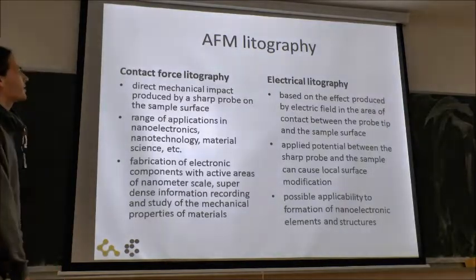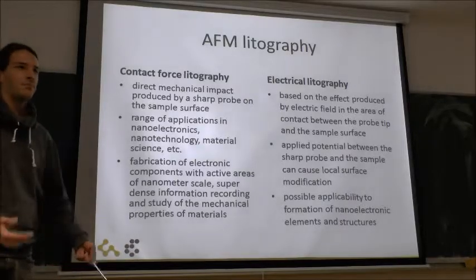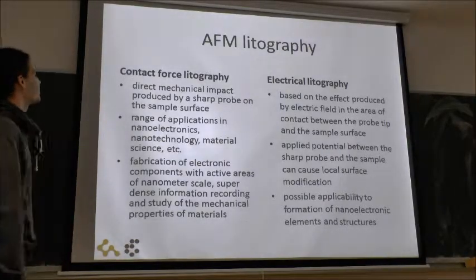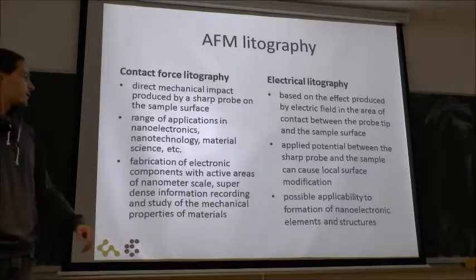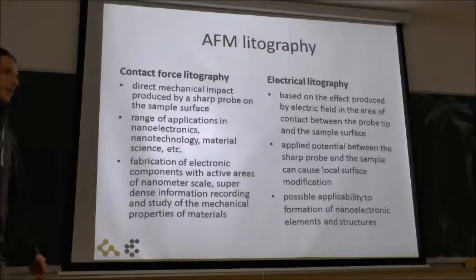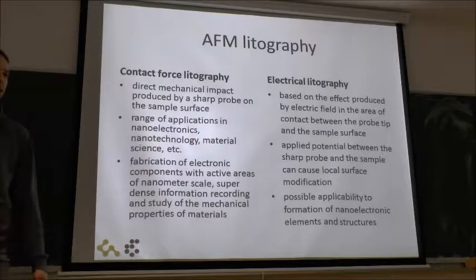What else can we do is AFM lithography. These things are maybe not so important, so I will just briefly tell that we have contact force lithography, where with the probe we are scratching the surface, and it has some applications in nanoelectronics and nanotechnology.